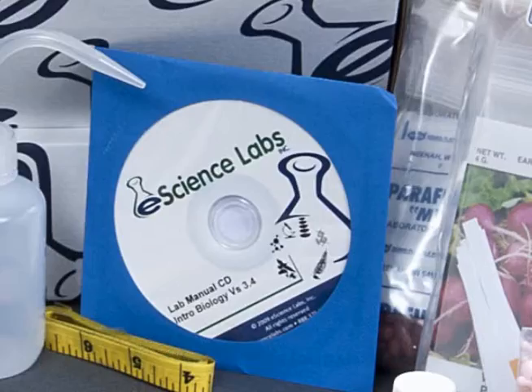Importantly also is this CD that has your lab manual on it. You will absolutely need this to do all of the experiments. As an alternative, you can find the lab manual online, but you also have to register with eScience using the kit code that we have.